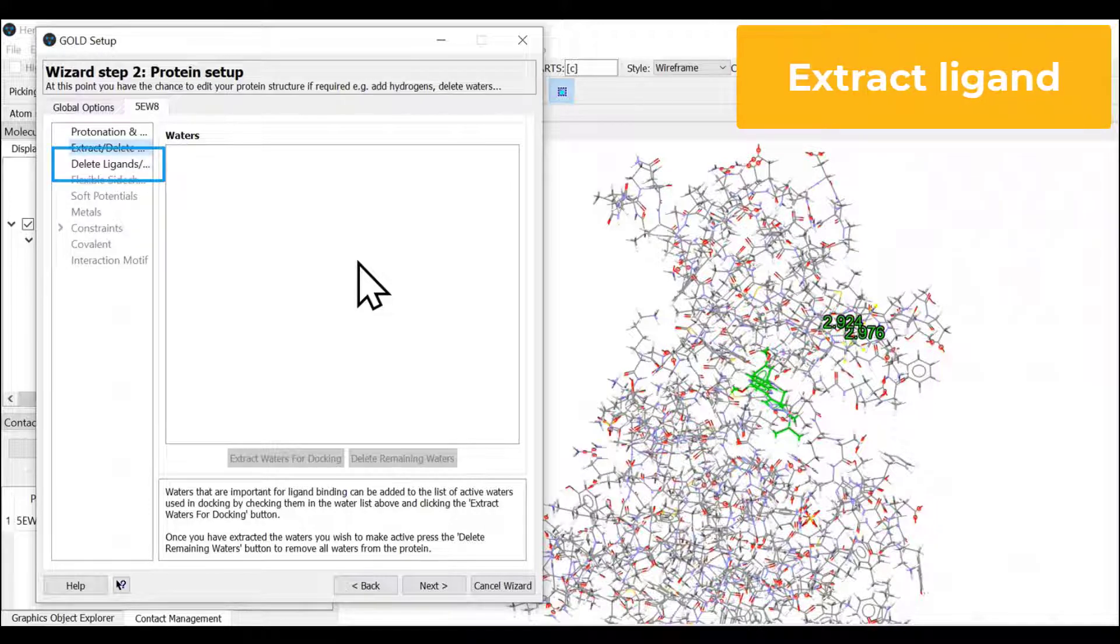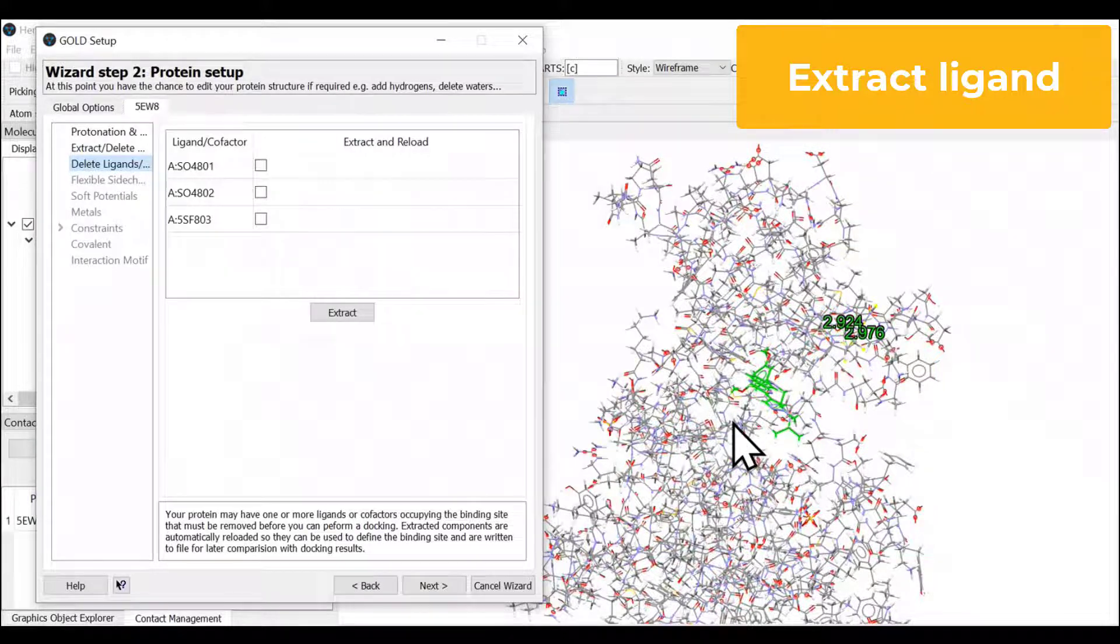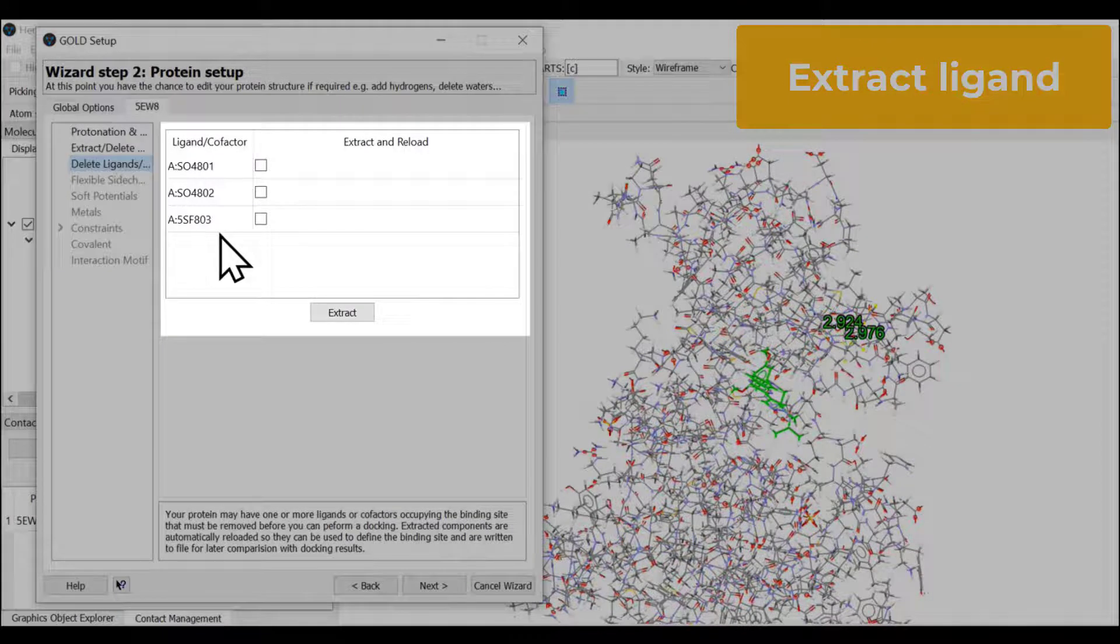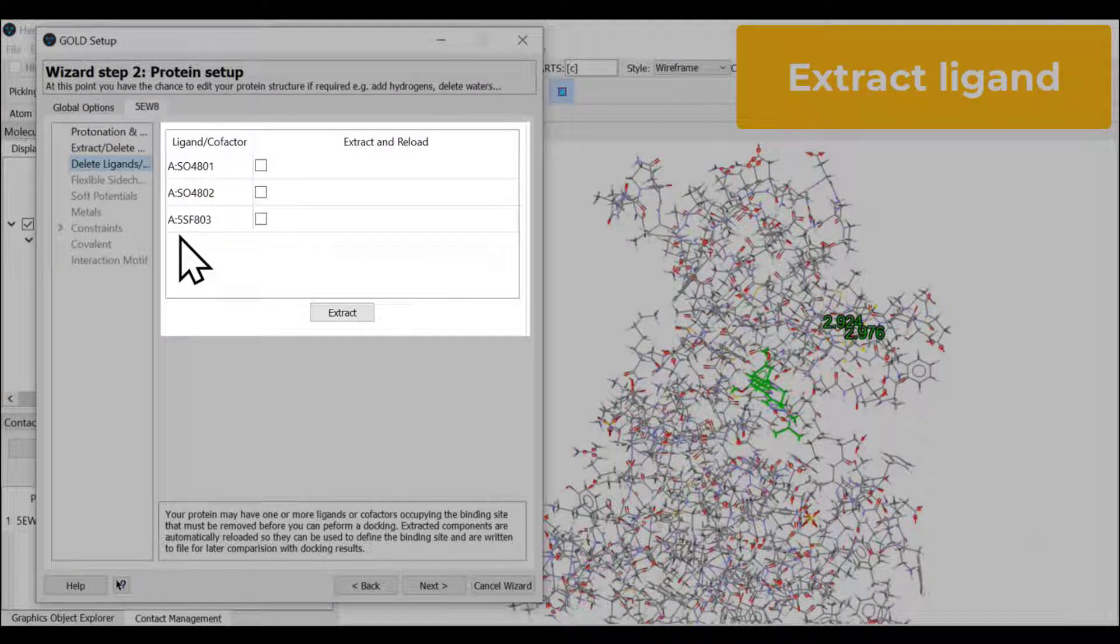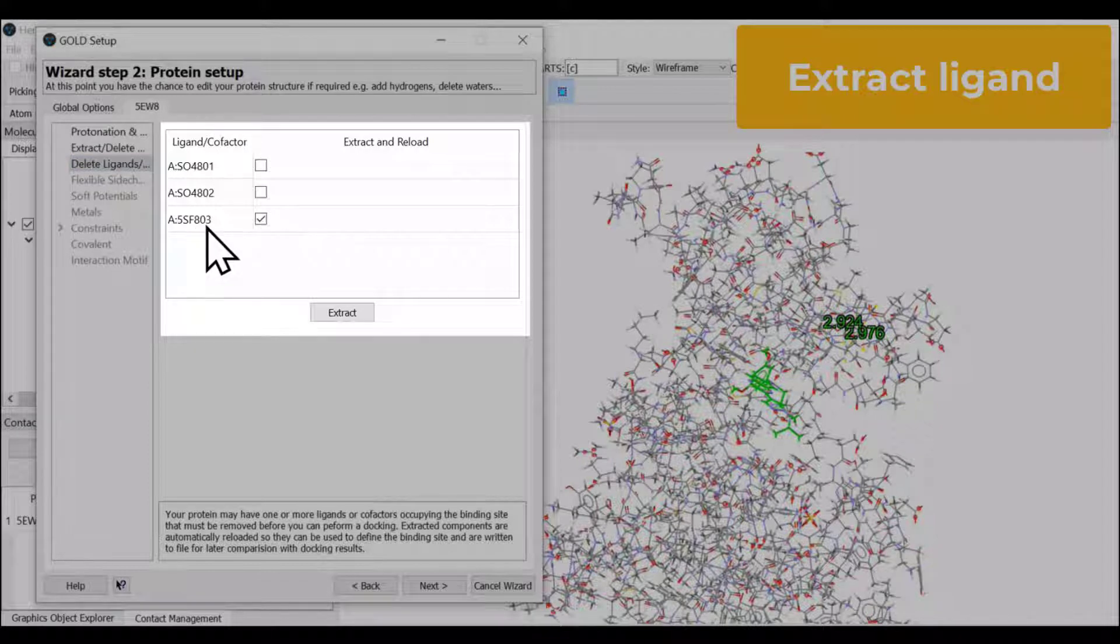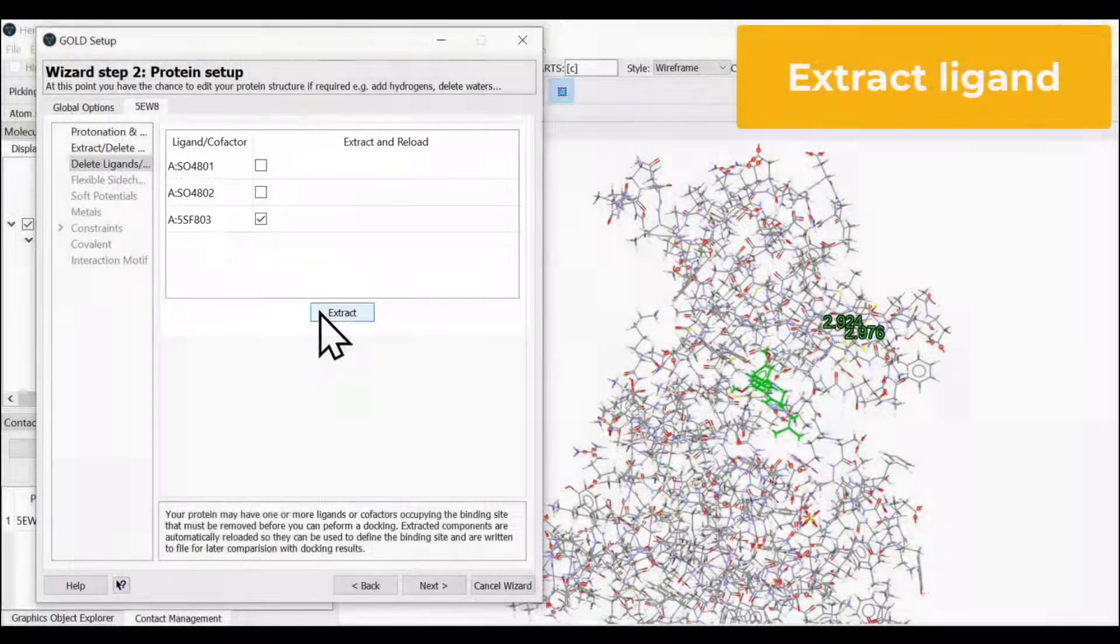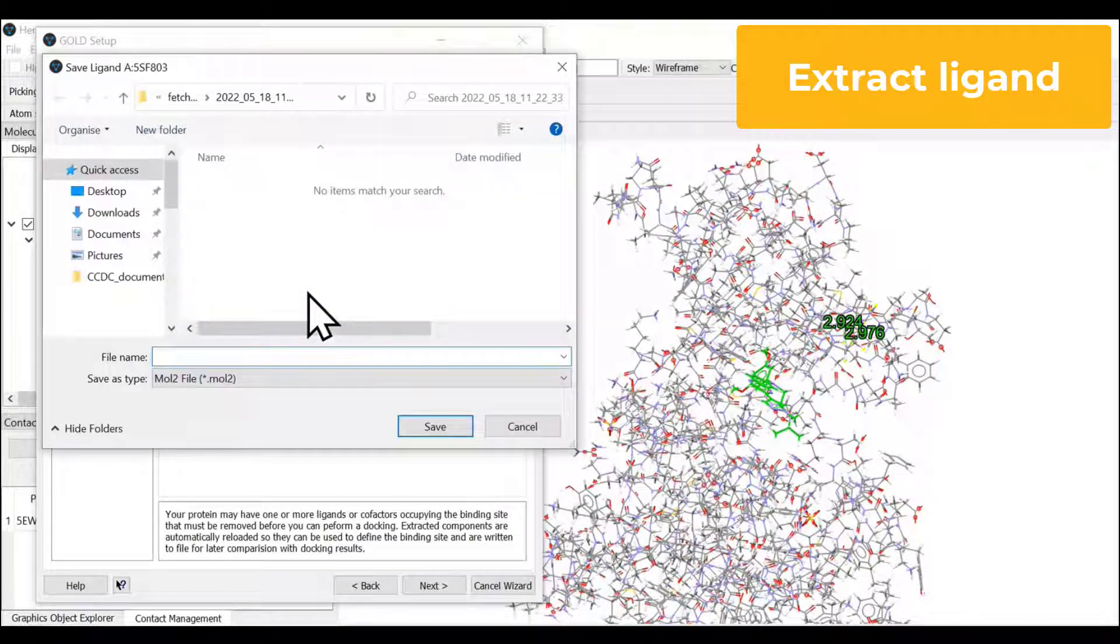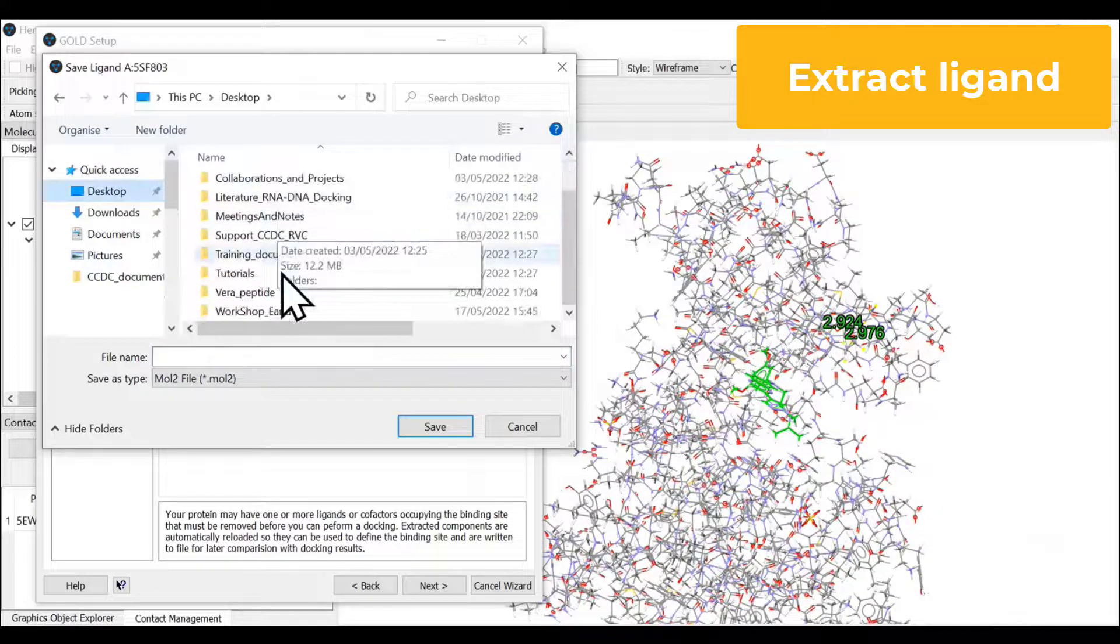Next is extracting your ligand molecule that is already present in the co-crystal. This is the ligand molecule. These are two sulfate ions we won't touch. We're going to select the ligand molecule 5SF803 and say extract. Now we can save this particular ligand molecule in our working directory.